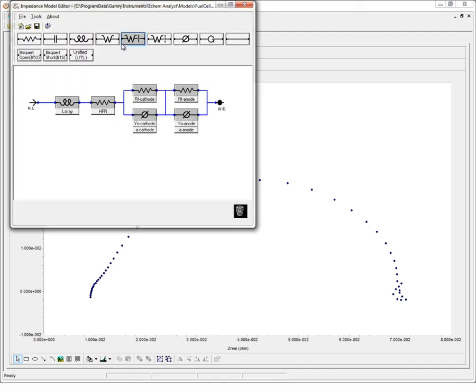Here is the model that we're going to use to fit to our data. We have stray inductance, high frequency resistance, and two RCs, one for the cathode and one for the anode.